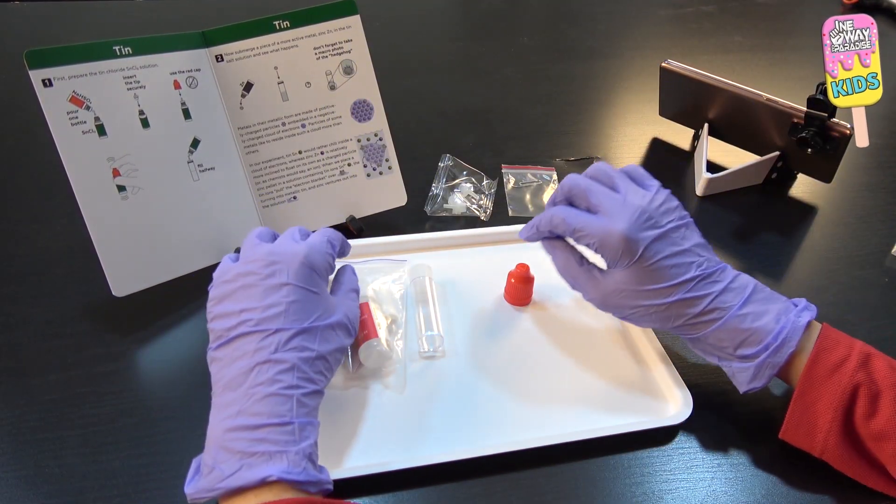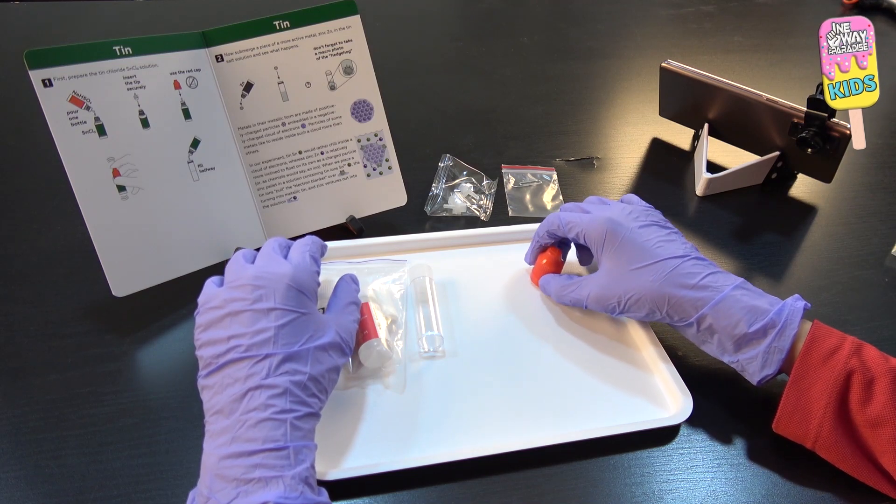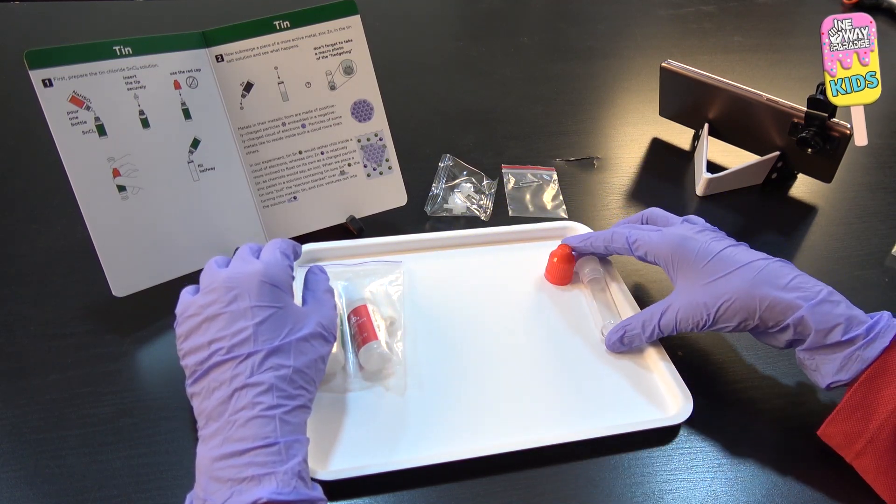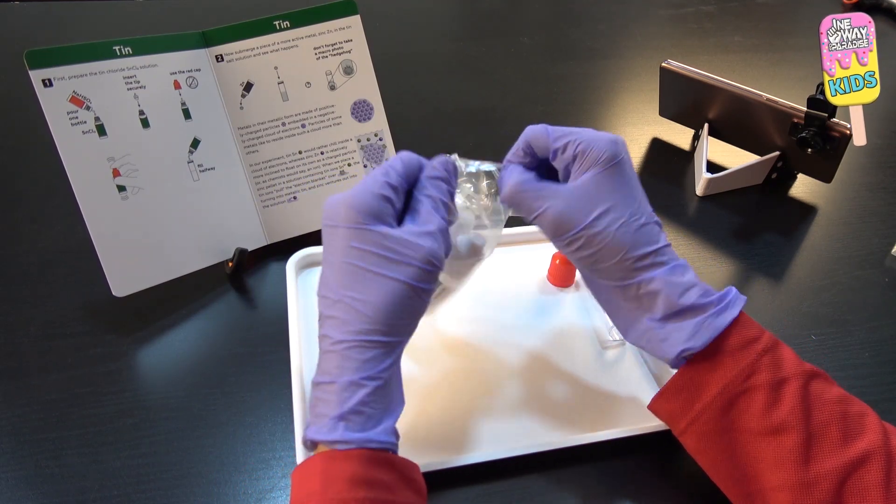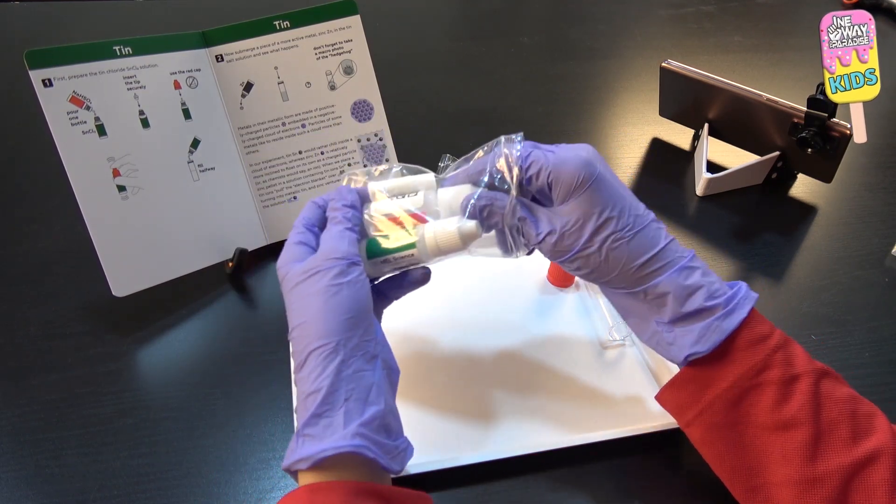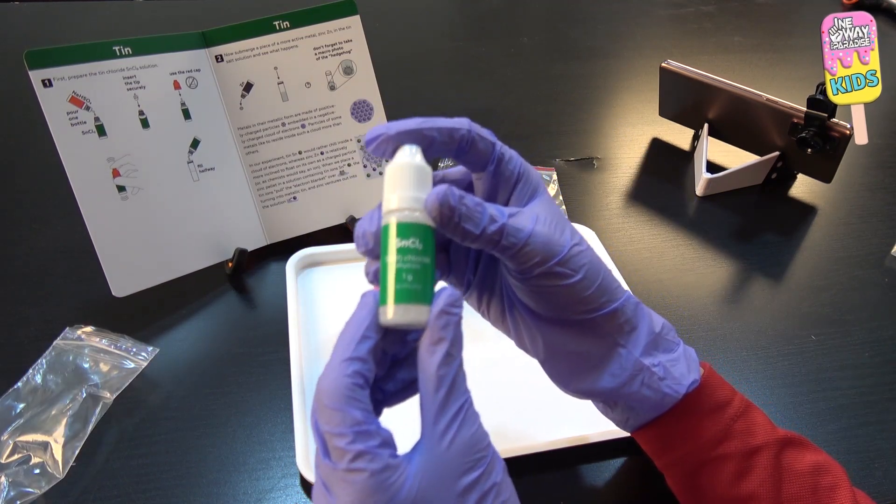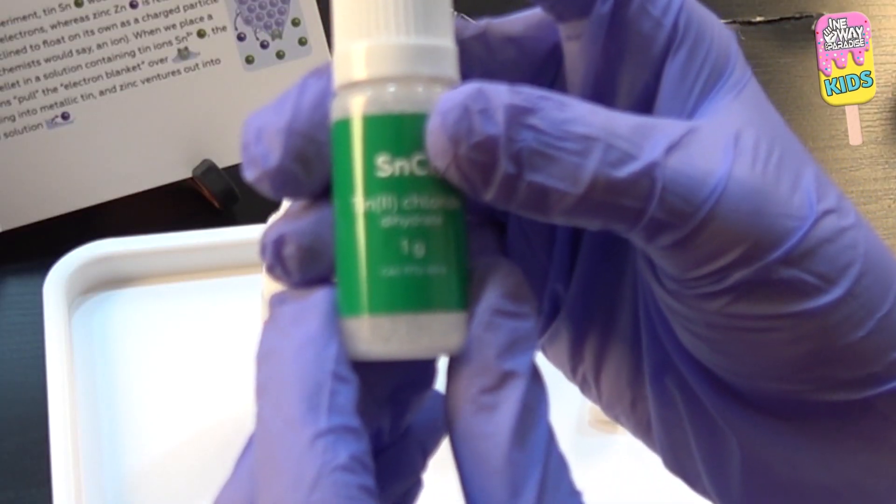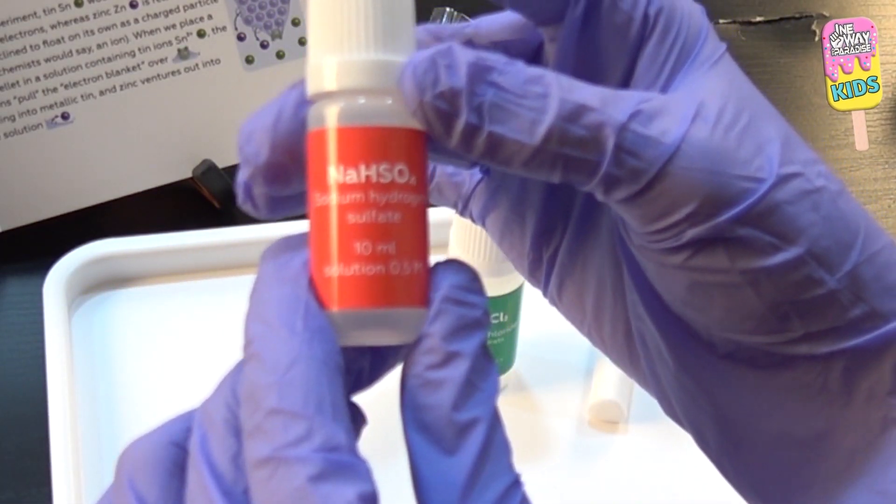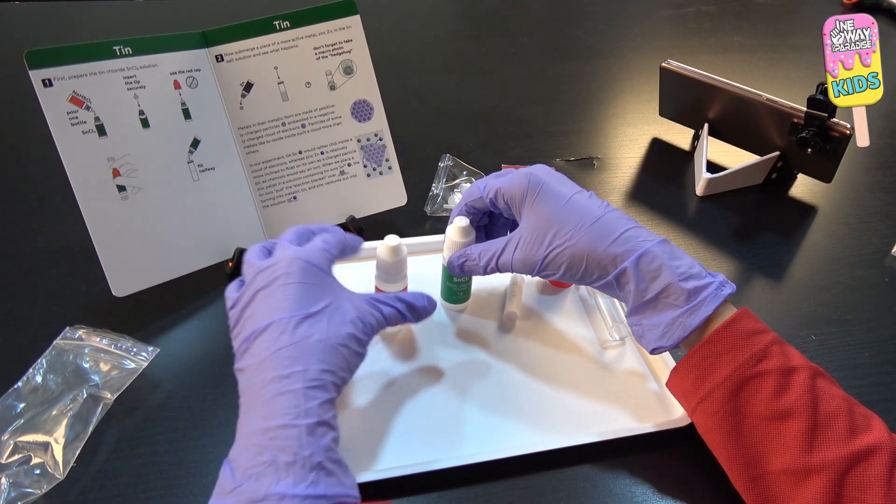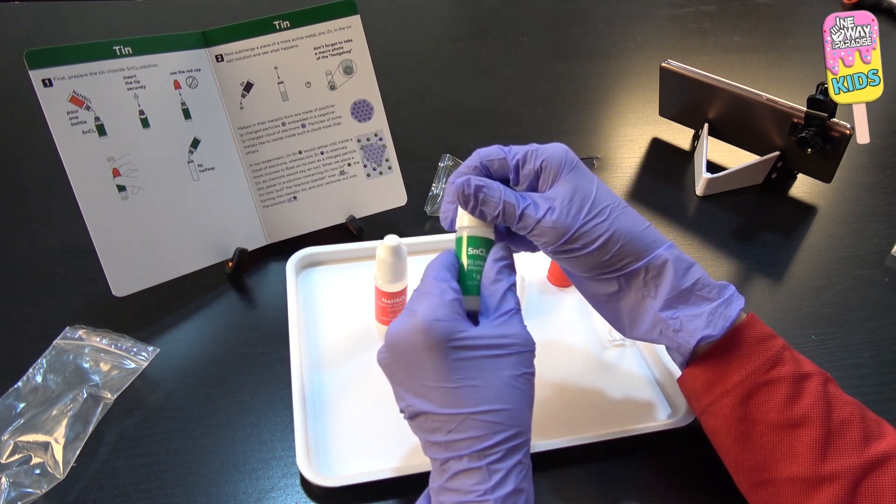Okay, so first we will prepare the tin chloride solution. I'll first take these out. So this is the tin chloride and this is the sodium hydrogen sulfate. We'll first open this tin chloride.